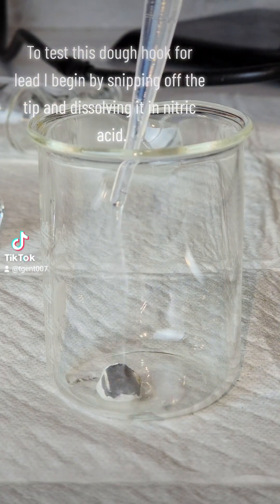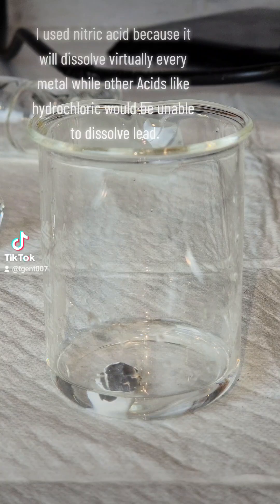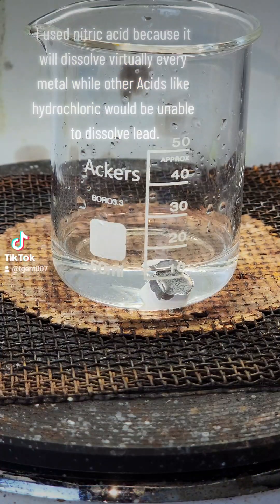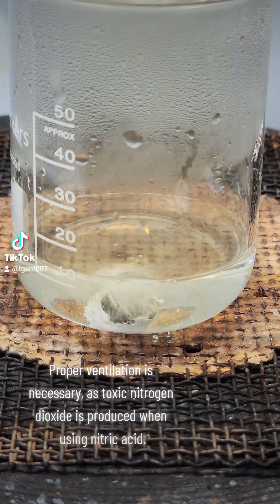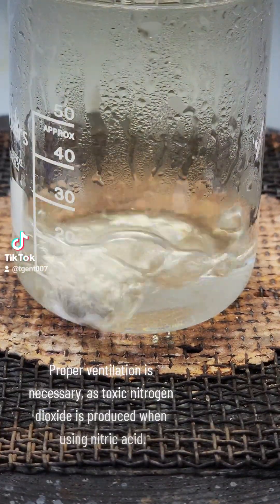To test this dough hook for lead, I begin by snipping off the tip and dissolving it in nitric acid. I used nitric acid because it will dissolve virtually every metal, while other acids like hydrochloric would be unable to dissolve lead. Proper ventilation is necessary as toxic nitrogen dioxide is produced when using nitric acid.